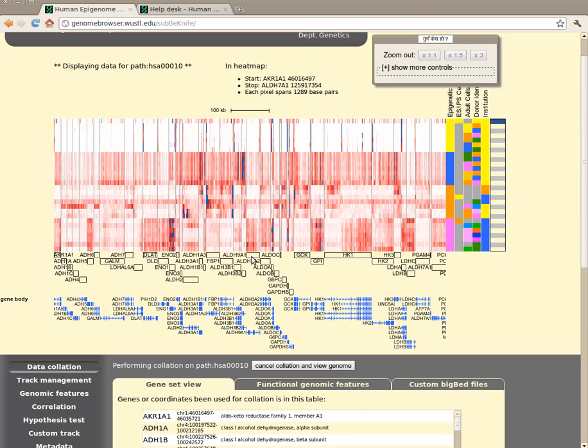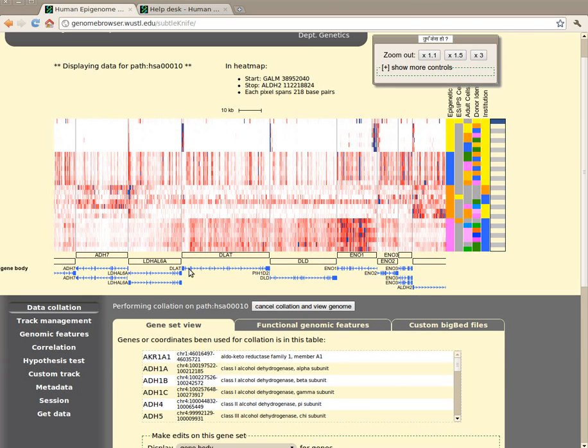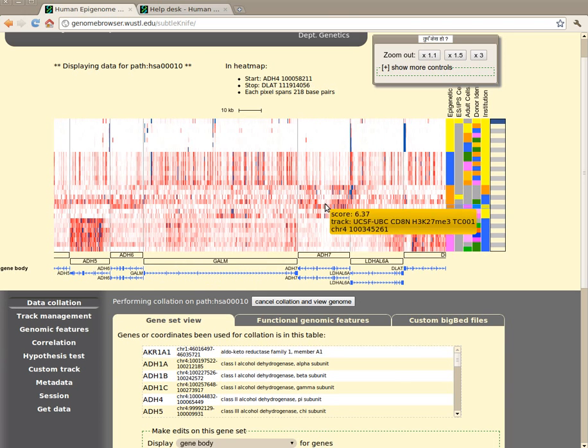Each box marks out one item in the geneset, one gene from the geneset you just entered, and they serve the same function as the previous cytobands: you can click and drag on it to zoom into this geneset and see the details. Right, so we just see some of the genes in a more detailed look.